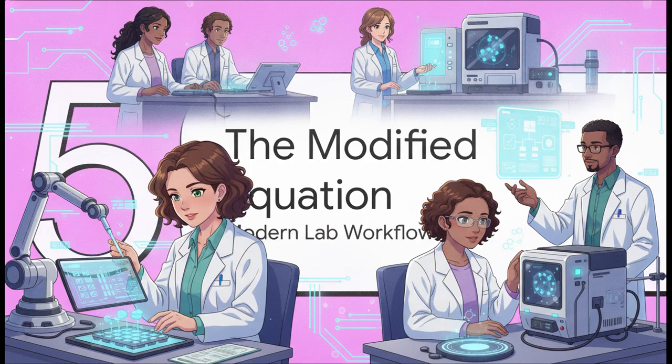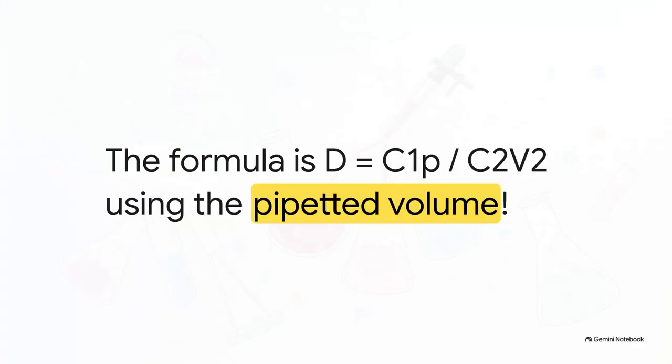Let's talk about the modern lab workflow. Okay, so we've covered the classics, but here is a very real modern dilemma. The standard C₁V₁ equation works great for humans working with glass beakers, but when we try to program robotics or write computer software to do serial dilutions automatically, the classic equation actually fails to give the computer the specific parameters it needs. Enter the modified dilution equation, or MD.